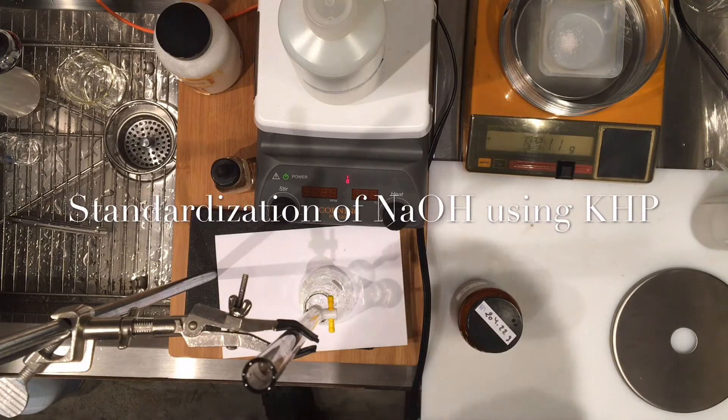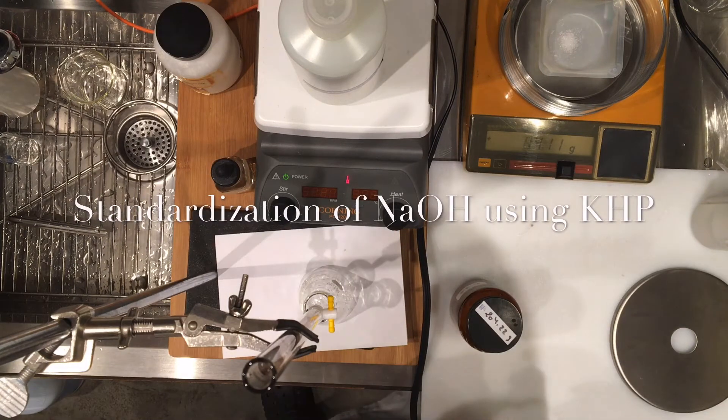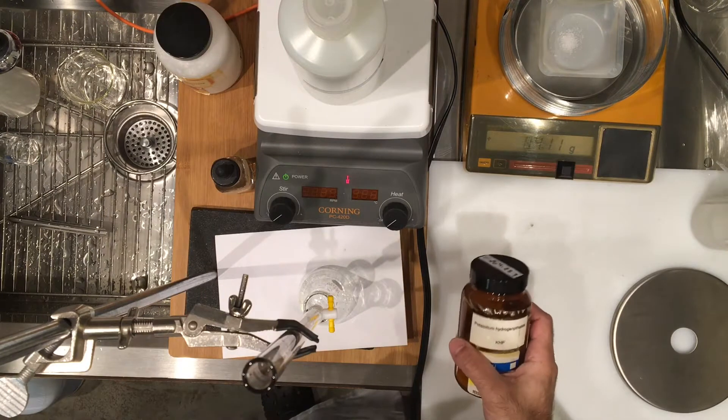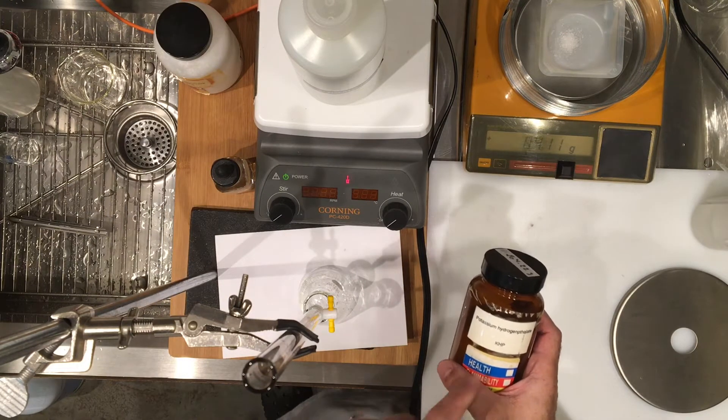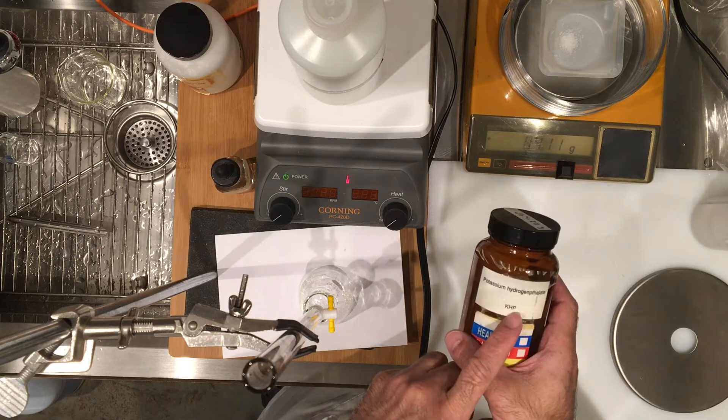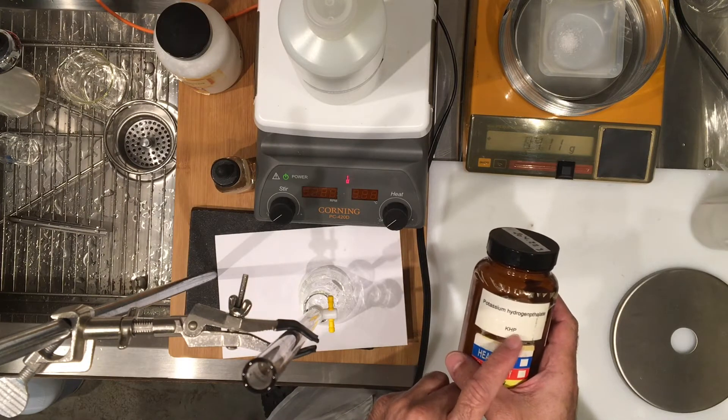We're going to show you how to standardize sodium hydroxide. So I have some potassium hydrogen phthalate. This substance is known for short as KHP, potassium hydrogen phthalate.